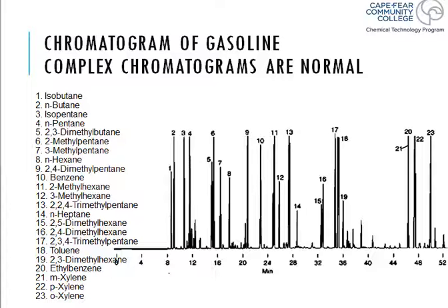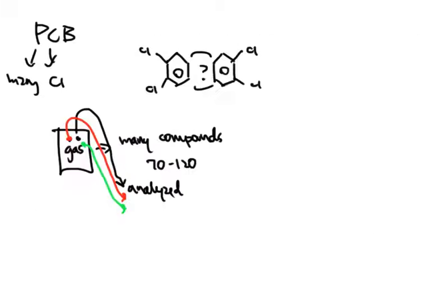So down here at the very bottom, you'll see an increment. This increment is in terms of time. So 0 minute, 4 minute, 8 minute, 12 minute, 16 minute. You actually see the unit down here at the very bottom. For almost all chromatograms, time is the unit on the x-axis, right? And that's pretty important to remember. So when I get data from the GC system, almost every time, time is down at the bottom.